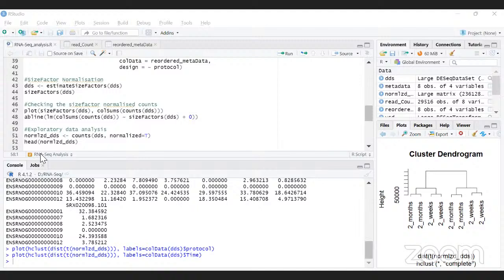Another thing you can do is take the transcripts. So all these transcripts are for a particular gene, right? So you can convert these IDs into gene IDs, and then look it up like that. But the thing is that for a particular gene, there might be several transcripts that have been expressed. So again, you would have to collapse those reads and then go down with the analysis. So you can actually look at it.